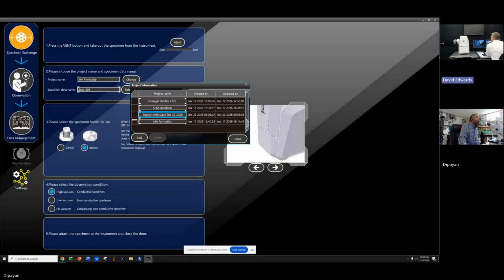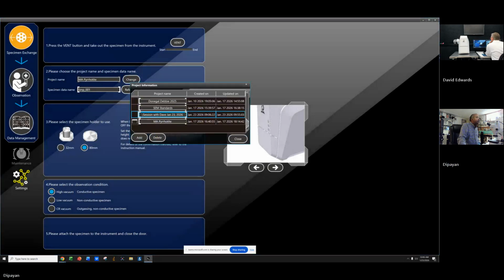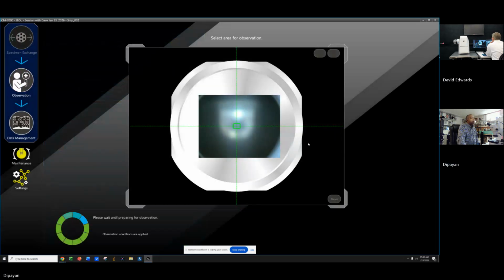Yeah, I'm looking at your screen, right there. Okay, so now I have the 80 millimeter. Everything is fine. So if I go to observation now. Right. So we need to vent.